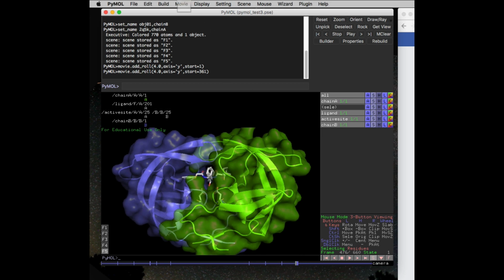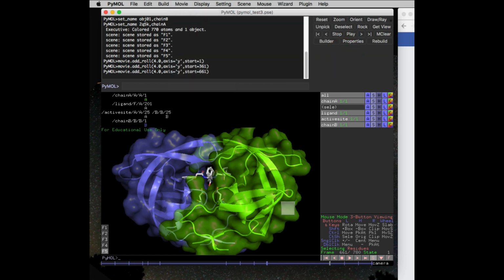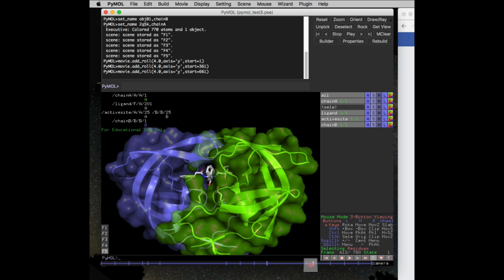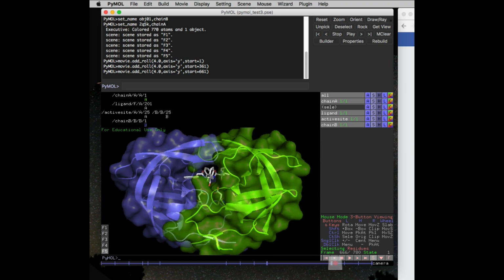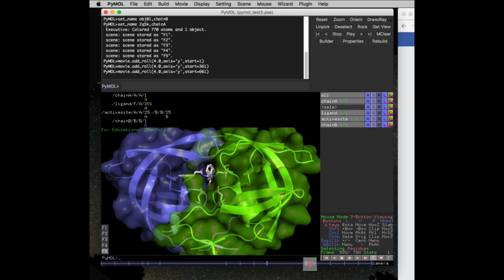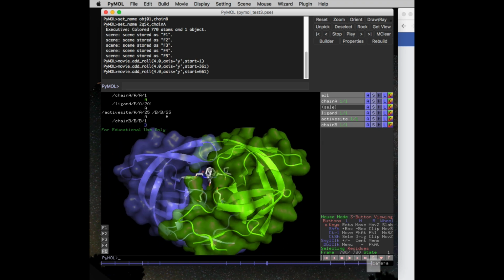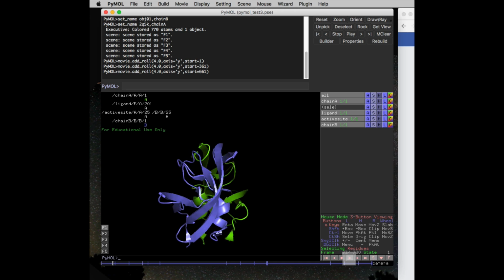Let's watch Blake struggle with this. Okay, so instead of trying to append there, let's do another Y roll, and now we see that we have a Y roll added to the end. It's a little annoying because I don't think I placed my Y roll exactly where I wanted it to be, but that's okay. We can push play and see what happens.